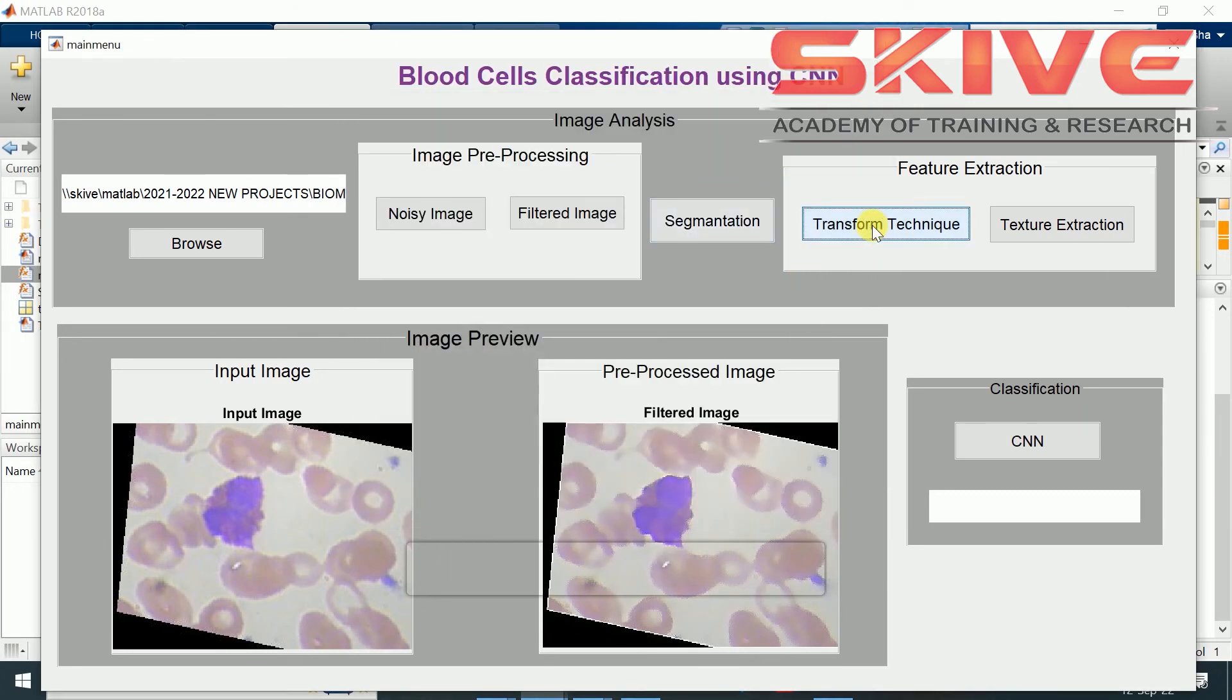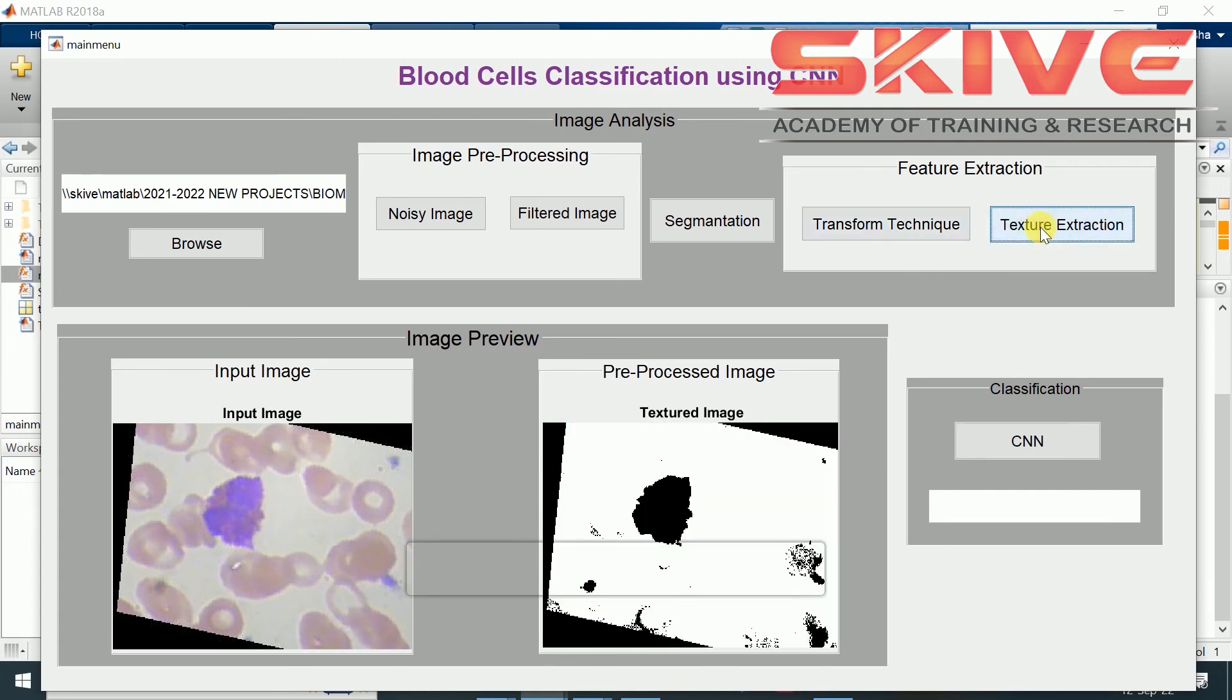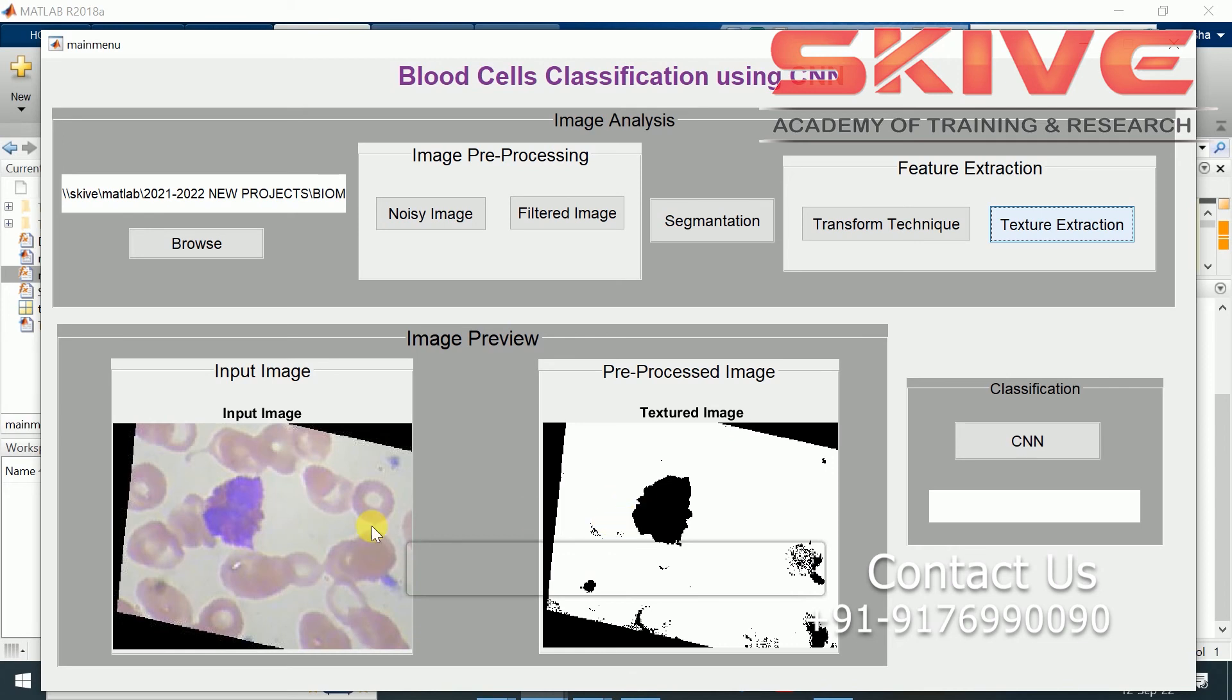The transform technique will include the coloring process and some image processing techniques will be applied on the image. We can see the final segmented textured image. These are some defected cells.